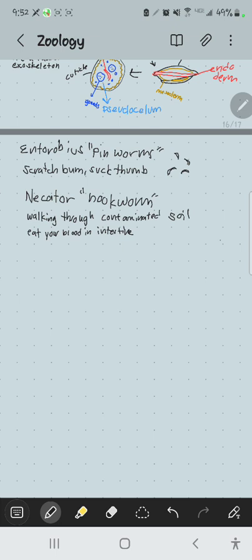What do you have to know? So we have Necator americanus on slides here. The Necator that you're seeing on these slides just looks like a little worm on the slide, so you can't see the little hooks on there. But if I have it on a test, the label that says Necator will be visible, so you'll know it's Necator, it's a hookworm. I also have this one. This is an Ancylostoma. An Ancylostoma is a hookworm that occurs in cats, and humans can get it. So you can get that if you walk in areas where cats have been. But basically, these are both examples of hookworms.